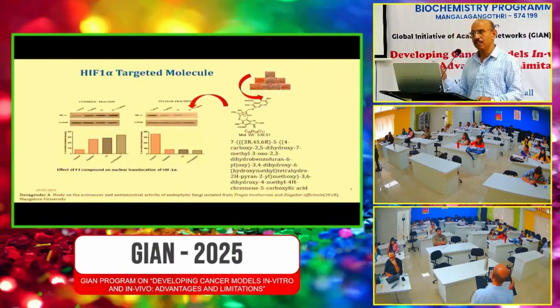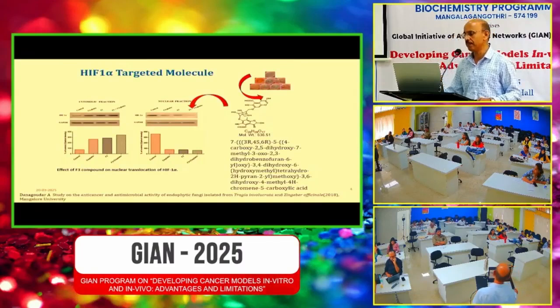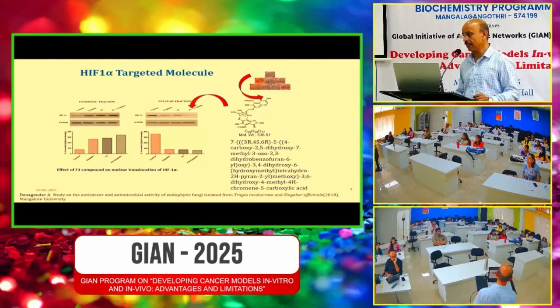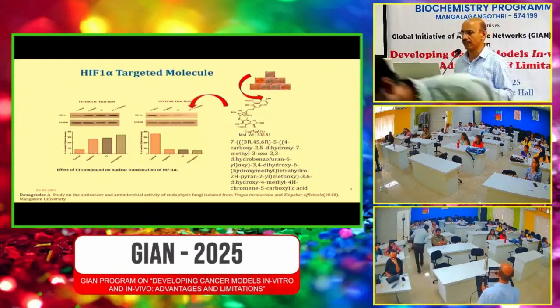And then I will switch over to the topic I was discussing yesterday. So we ended up with this result actually yesterday. Mr. Anand worked on the isolation of the compound, and once he isolated the endophyte from the medicinal plant, he purified the compound, and then we found out that this actually acts on HIF1 translocation. It is inhibiting the HIF1 translocation to the nucleus.